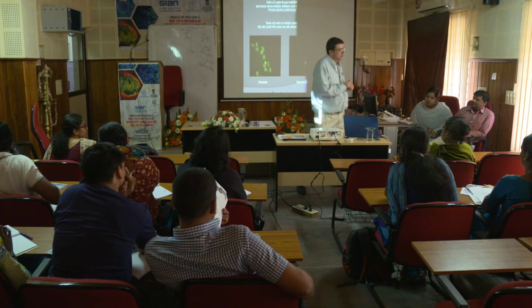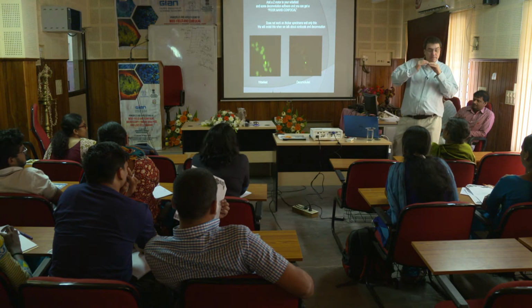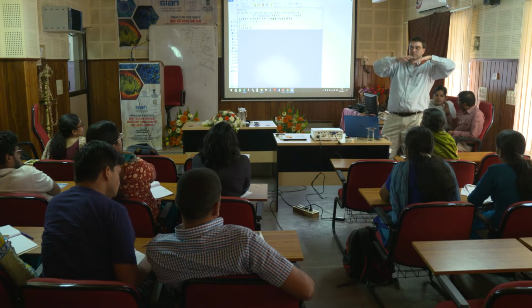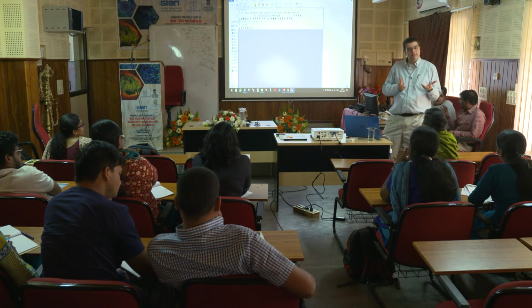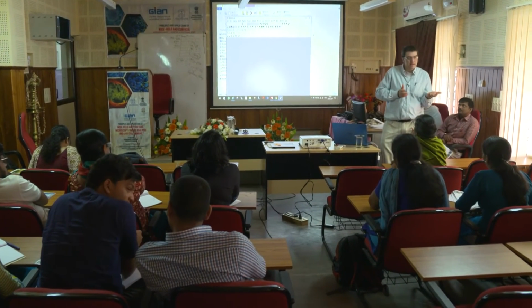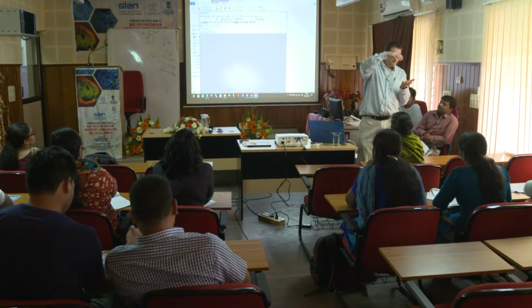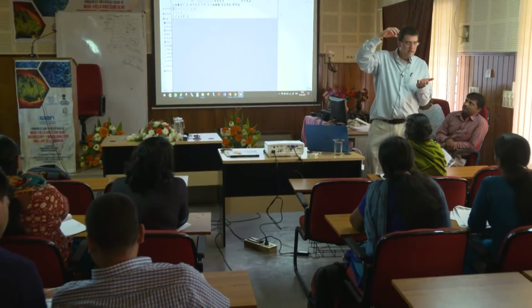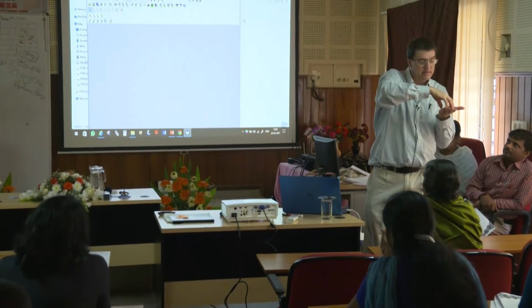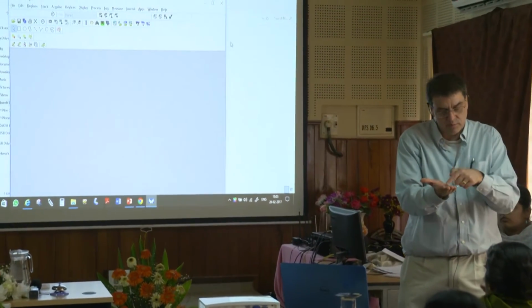Well, your green fluorescent protein or your antibody should just be brighter than that to some extent. It might not be, so how do you know it's really your signal? A lot of that comes down to controls that you'll do. When we do antibody staining, and I have a lecture on this coming up, you'll put in a primary antibody, a secondary antibody. So you'll do one sample of just the secondary antibody to see where it sticks, or where it's non-specific. And then you'll compare that to the one where you use the primary and the secondary.